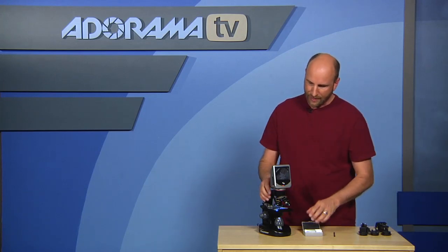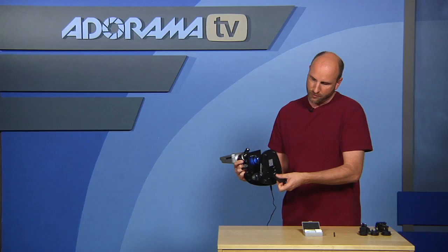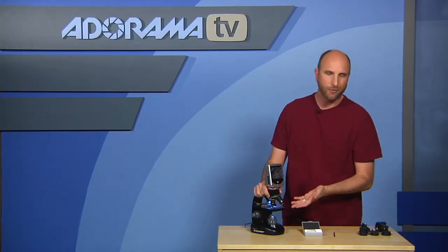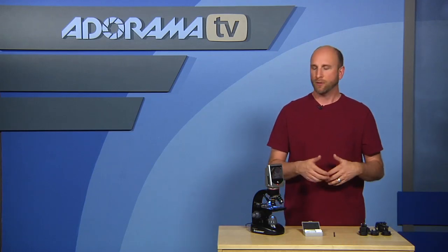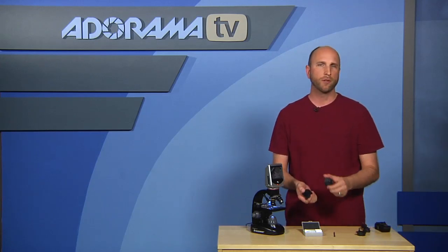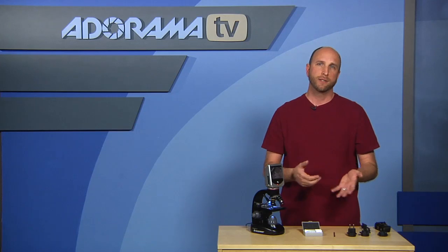This works on an AC adapter — we've got it plugged into the wall right now — or you can run it on four AA batteries in the bottom. So if you're out in the field and you want to look at something and take pictures, you can do that with batteries as well. The AC adapter works virtually anywhere in the world — it comes with different connectors for Asia, Europe, the United States, South America — and it's compatible with both 110 and 240 volts.